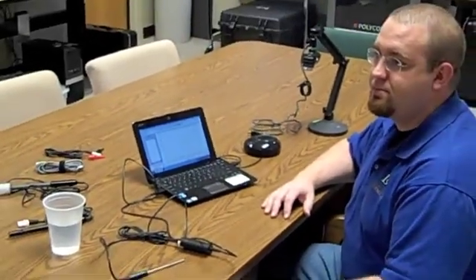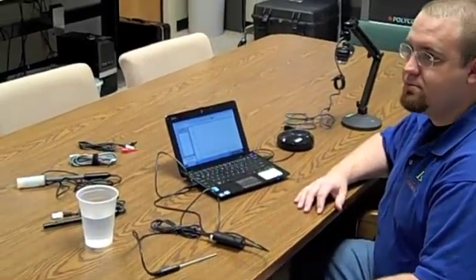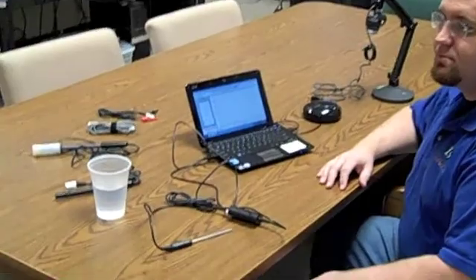Okay. And that's pretty darn cool, might I say. So let's go ahead and talk about a little bit of the different technology that you have on the table here. What's this?